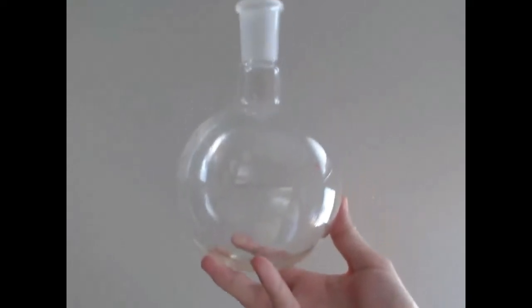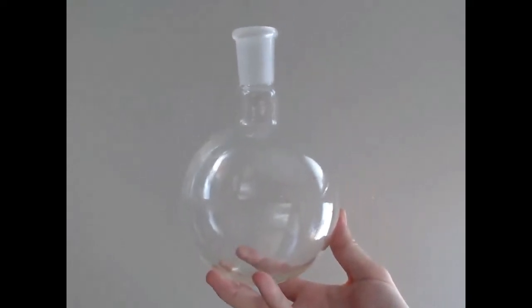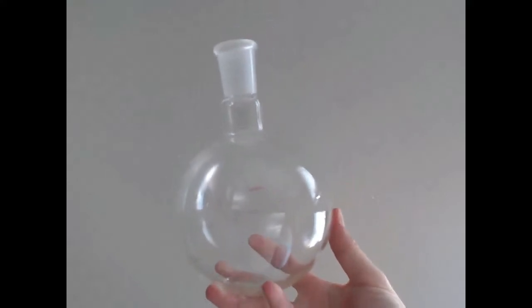This is the round bottom flask I just mentioned. This will contain the raw materials that will be heated by the heating mantle, which will cause the water and the oil to vaporize so it can be isolated.